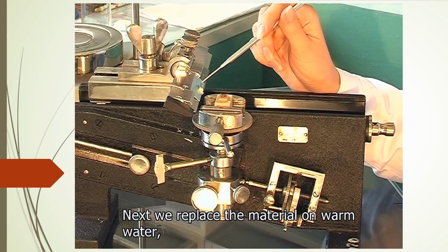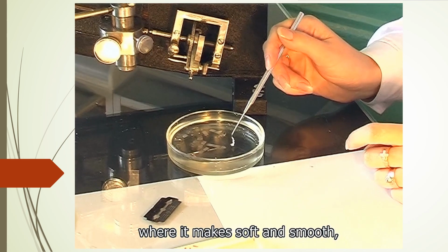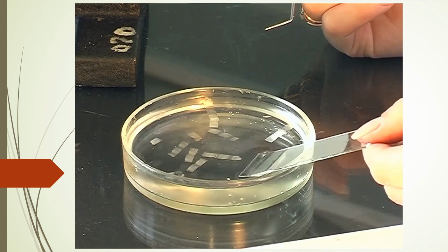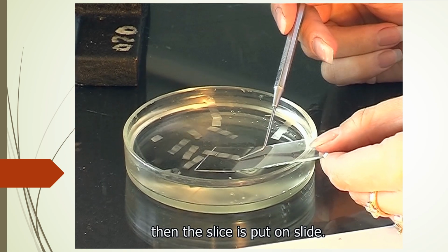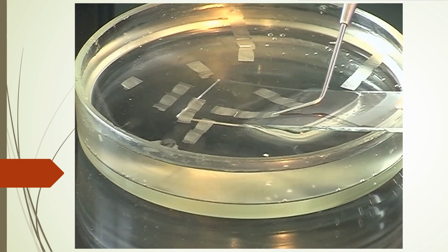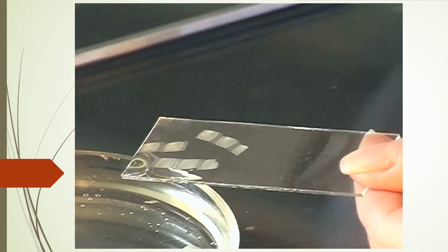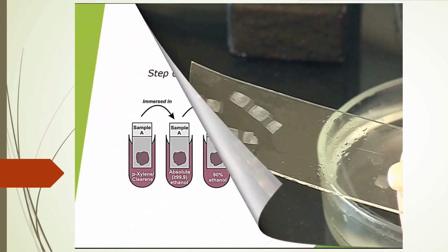Next we place the slice on warm water. Here it becomes soft and smooth. Then the slice is put on a slide. Serial sections are made like this.